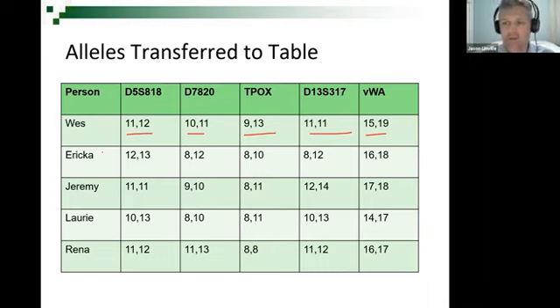All right, so this is a little confusing. If you want to do the minimum amount of work, you should know what I'm looking for when I ask: how do forensic scientists differentiate alleles from different loci at the detector? Just say you can use different colored dyes and you can move the primers so each locus comes out at different times. So even if you label them all with a blue dye, you could get all the alleles for one locus to come out first, and then the second, then the third, and then the fourth.